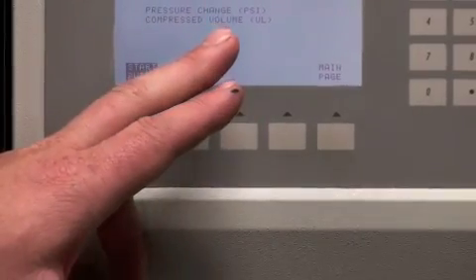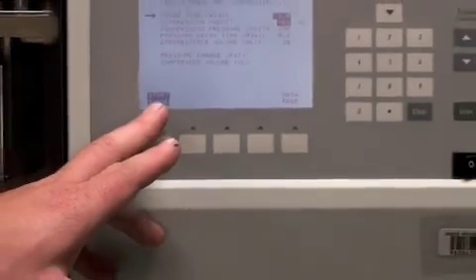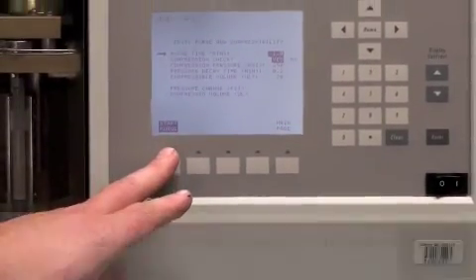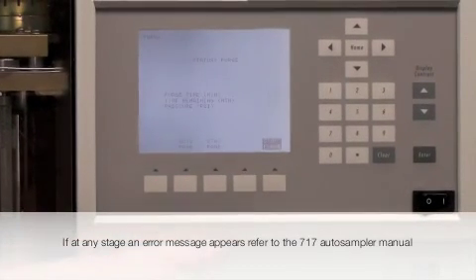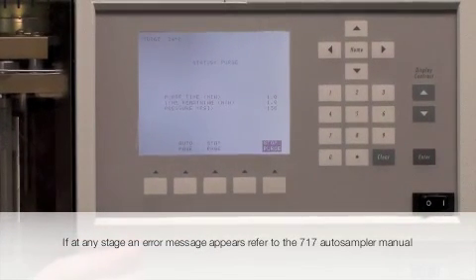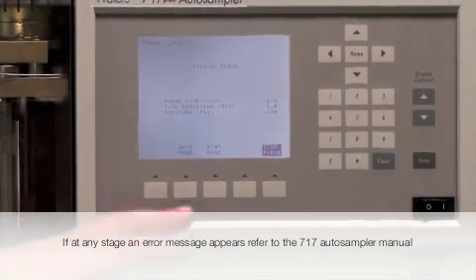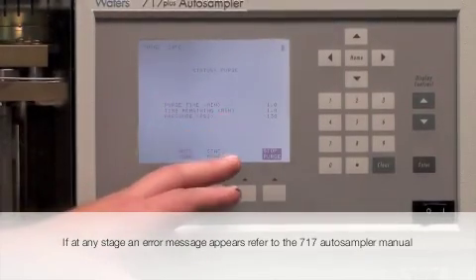After pressing it, this screen appears, and in the bottom left hand corner you can see the word start purge, you press that button. It then for the next five minutes will go through a purge process. At the end, it will give you a diagnostic on how successful it was.